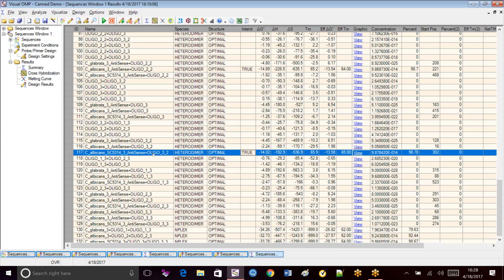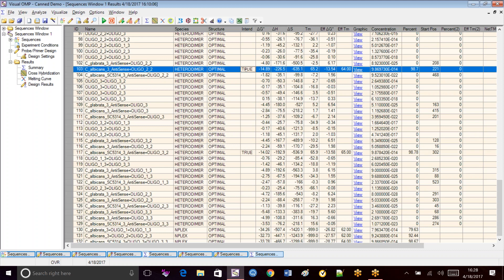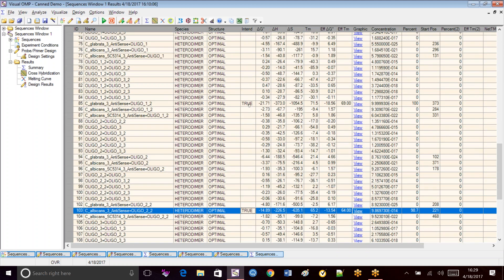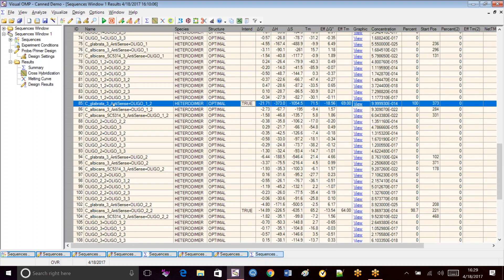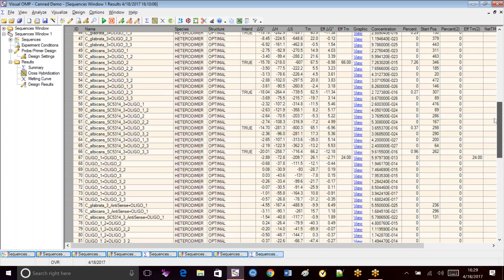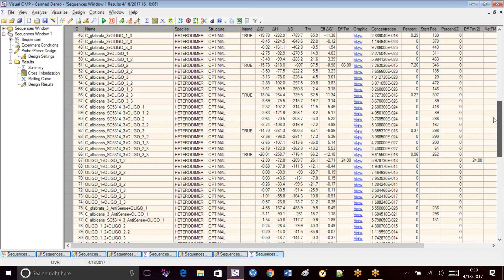Here we have the Albicon variant with the forward primer on the antisense, finding 98.78%. Here we have wild type Albicon, antisense with its reverse primer, finding 98.7% of the antisense strand. And then the other reverse primer is right here for Glibrata. Or this is a forward primer. You can see antisense for Glibrata. It's finding 100% of that. So it looks like our primers are in good shape. It's just the addition of the probe that brings down our percentage balance.